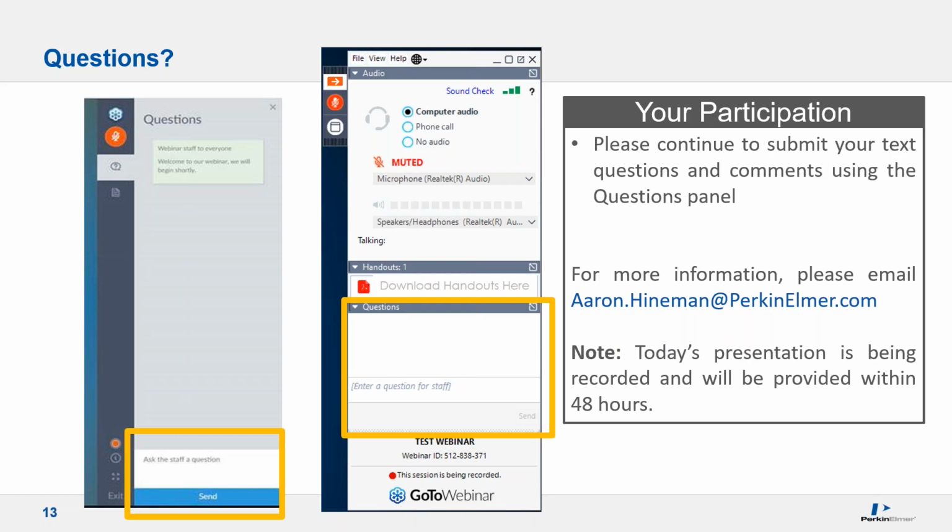Following up on the MSF thing where you're just identifying a blank and an analyte, I have seen that used. You've got to be a little bit careful. It does a really good job of removing that background spectra and reducing background noise, so you get some really good detection limits. If you have a very consistent matrix and you know that there's not going to be an interfering peak, it works well. You just have to watch out sometimes for interferences that are random. Like some environmental samples, once in a while you get a strange sample that could affect that result, so you should always be on the lookout there. But MSF does a pretty good job of reducing the background noise, even if you just identify a blank and analyte spectrum.